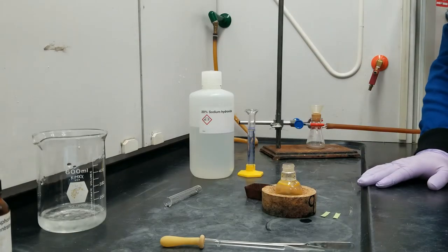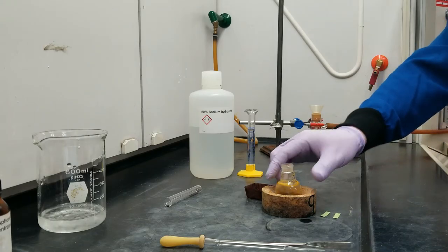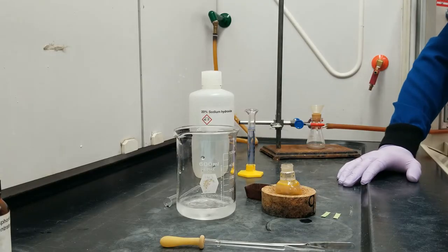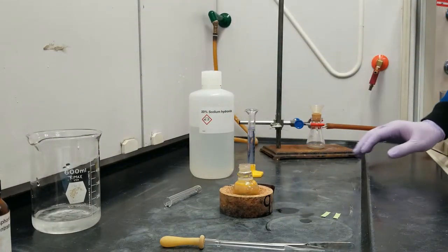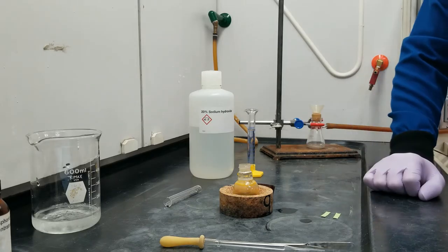So, in the cut, we waited for our reaction to cool completely, and I honestly just swirled it around in a little bit of ice water just to be absolutely sure that we were down to room temperature. So, now that we're here, let's go ahead and start working on separating out the acetyl ferrocene and ferrocene from the rest of this solution.